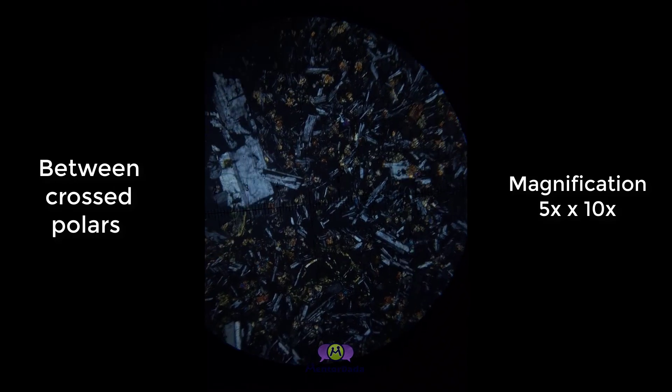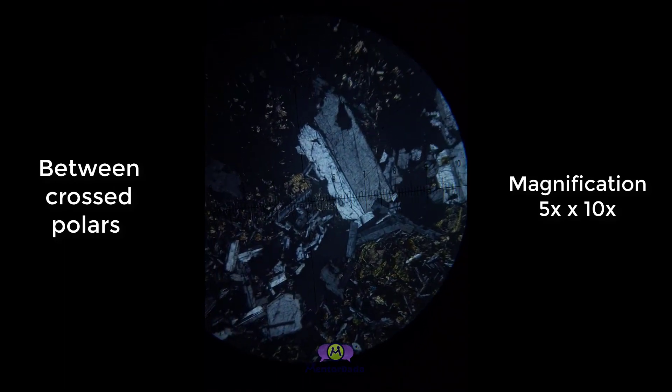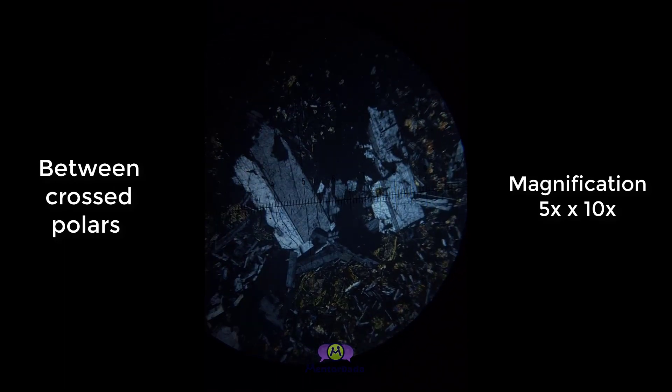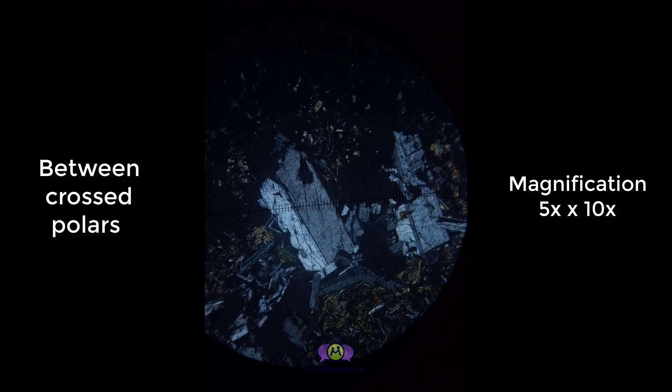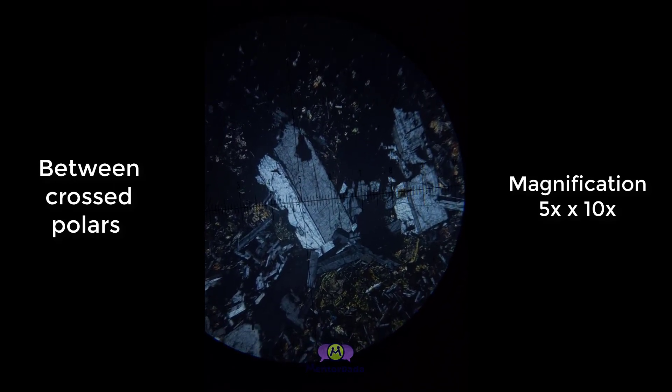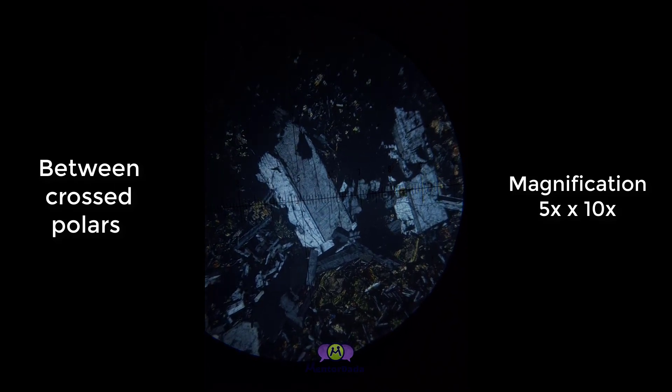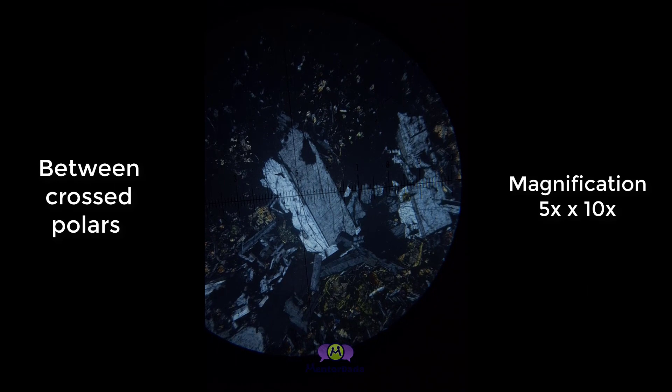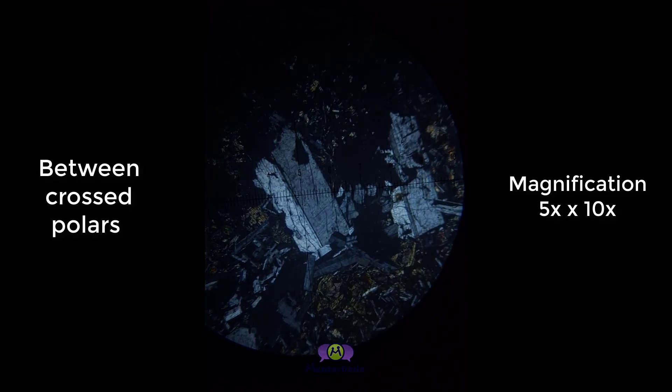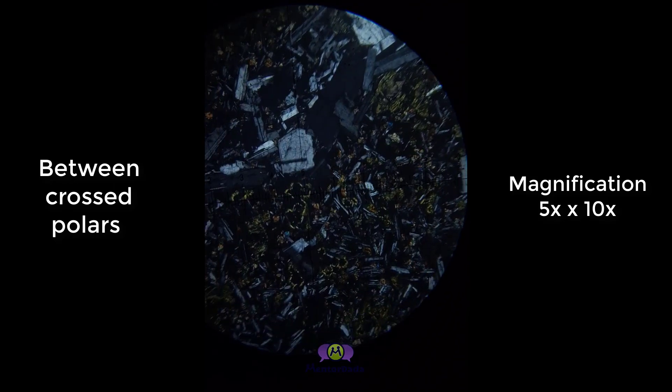Here you are observing a large plagioclase feldspar, and you can term this texture as porphyritic texture because the large grain of plagioclase feldspar is embedded in a fine-grained groundmass.